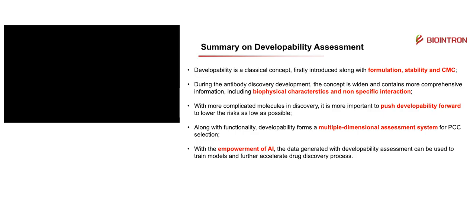Since we are working on antibody discovery and development, the concept has widened and contains more comprehensive information, including biophysical characteristics and also non-specific interaction. So we use instruments and also ELISA plate-based assays to do developability assessment.